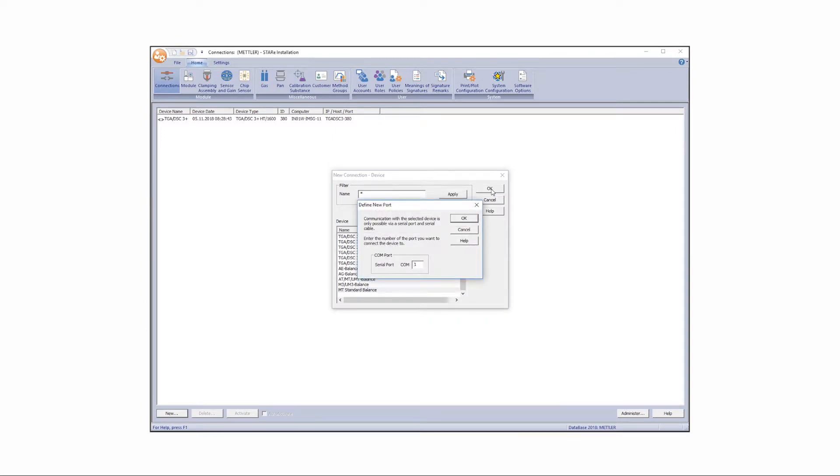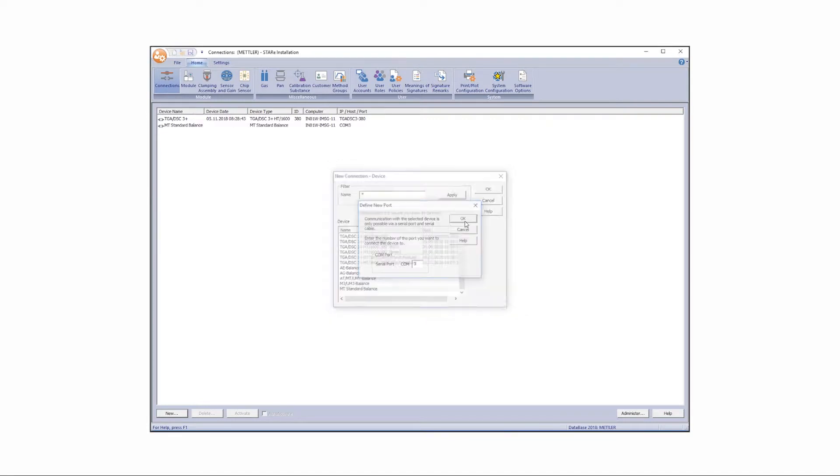To enable communication with the selected balance, another dialog box appears which allows you to define the port to be connected to the balance. Click OK.